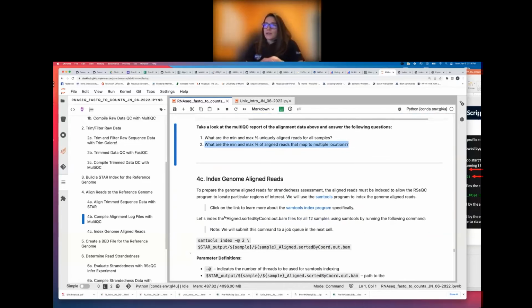And so now that we have our mapped reads, we want to quantify them. However, before we quantify them, remember when I was talking about library prep and we went through how the Illumina library prep is a stranded kit? Well, we need to find out how that strand orientation was maintained relative to the reference. So before we quantitate, we need to know which sense or antisense mapped reads we need to quantitate, again, based on the strandedness of the kit, if it's a stranded kit.